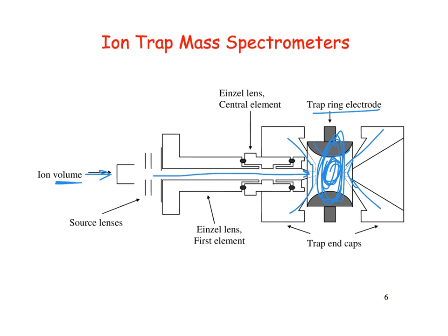And in fact, in a single instrument, they can select ions, then add some energy to those ions and cause them to do a second fragmentation based upon collisions between them. So they can do this whole tandem mass spec experiment in the same instrument.